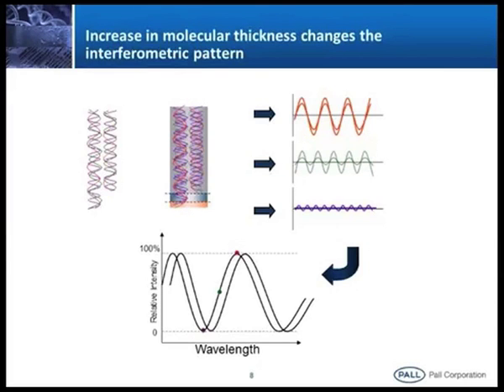The path length increases, right. That path length is also dependent on the concentration. The more the concentration, the more molecules bind, and your optical thickness increases. If there are fewer molecules, then the shift will be less. Due to the interaction, we can see there is a shift in the waves. Can you see these patterns? This is due to the interactions.